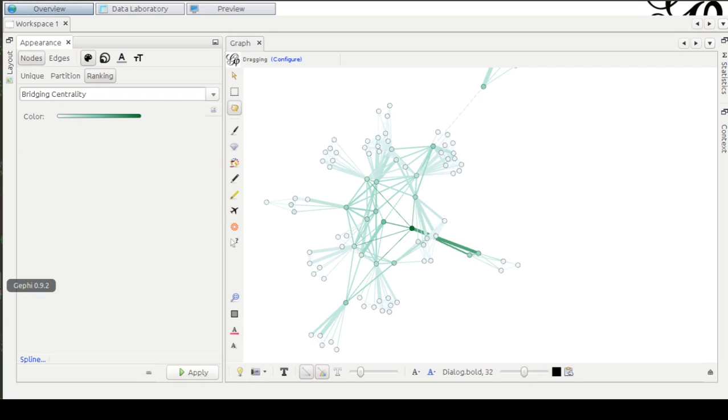For larger genomes, you can have much more time to process all the genomes. For example, considering 15 genomes of Corynebacterium, we have more or less 50 minutes to process all the genomes. But for other, larger genomes, like Escherichia coli, you can spend at least 5 hours to complete all the network interactions.